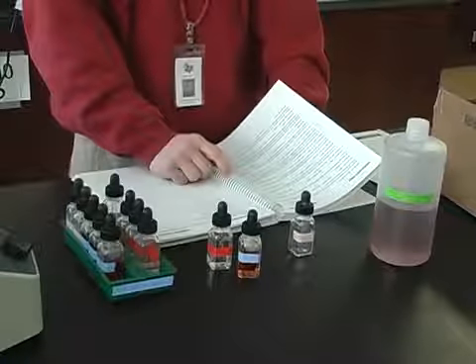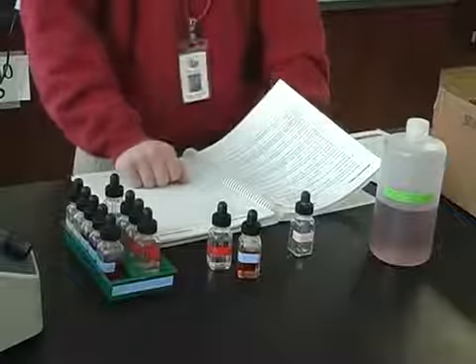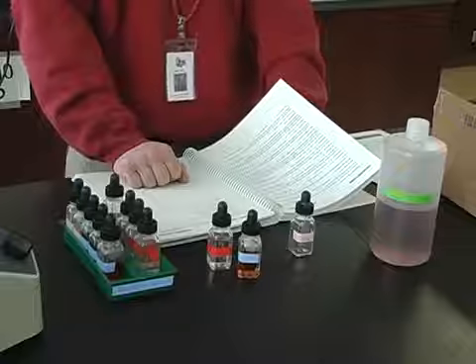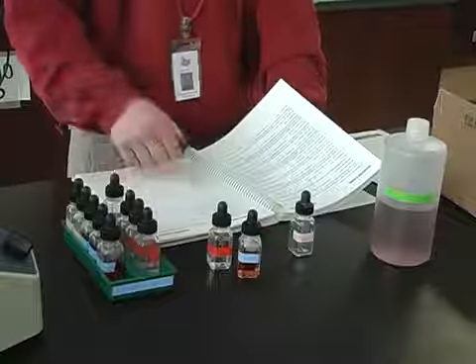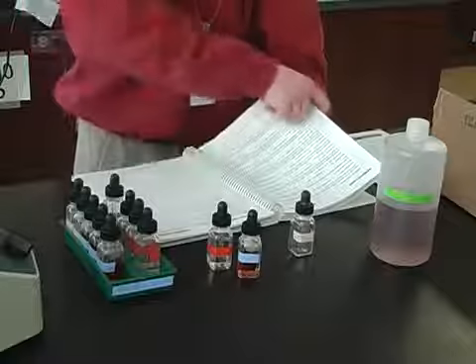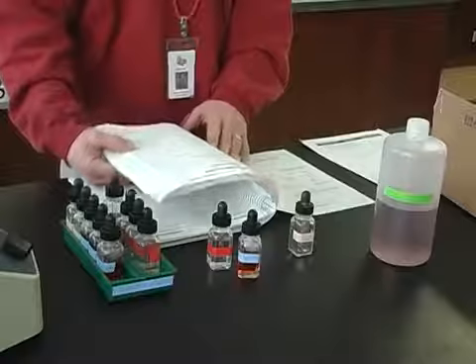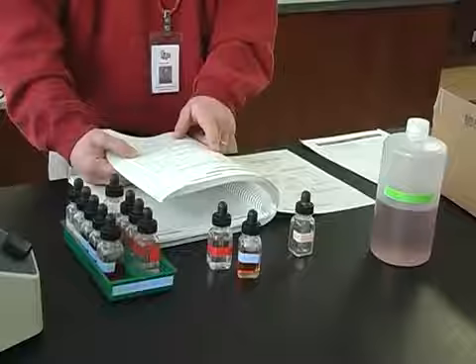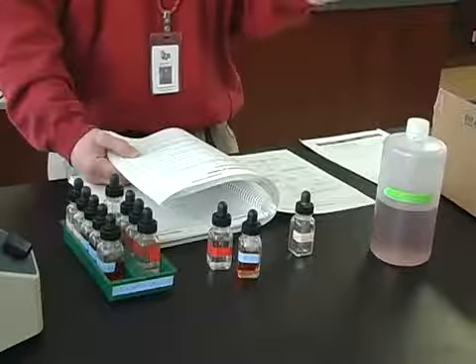Well, it says that it's a colorless solution, and that's a clue. And I'll have all 10 solutions out here for you to see before you start. And it turns out that cobalt, manganese, and iron actually have some color to them. And you should memorize those colors like we've done in the past. The second thing is that when you add NaOH and H2O2 to them, which one of those ions that's in there will actually dissolve? Now we ruled out manganese, we ruled out cobalt, we ruled out iron. What about bismuth or zinc?